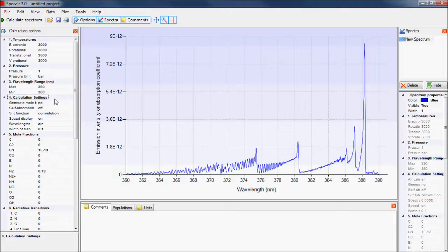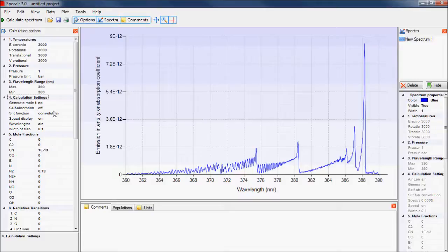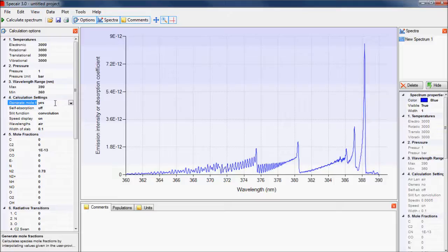Usually, the composition of the gas is specified by the user in the mole fraction sections below, but for air at atmospheric pressure, SpecAir can automatically calculate these instead by setting generate mole fractions to yes.